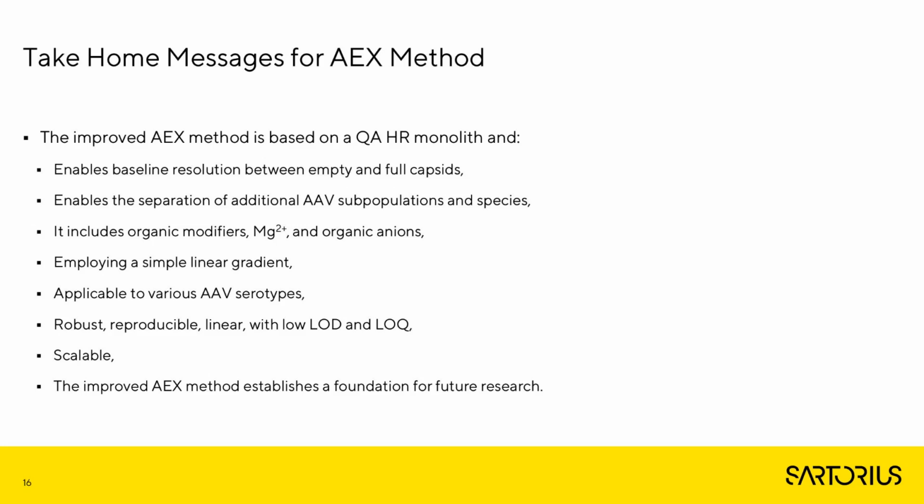With method validation, we can conclude the method is robust, reproducible, and linear, with a low limit of detection and limit of quantification. The method is also scalable, which is really a key advantage specifically for AAV purification.